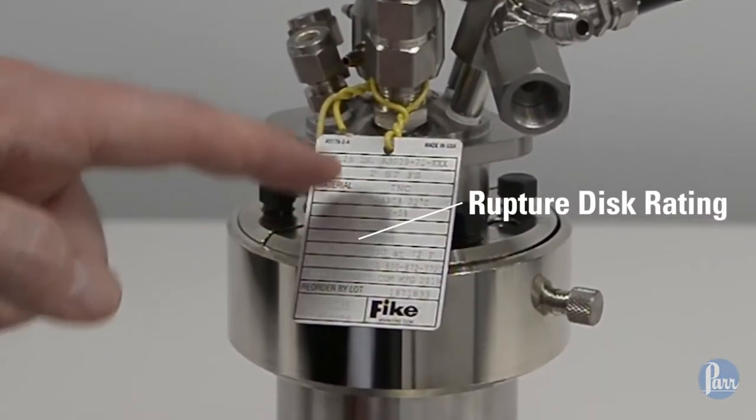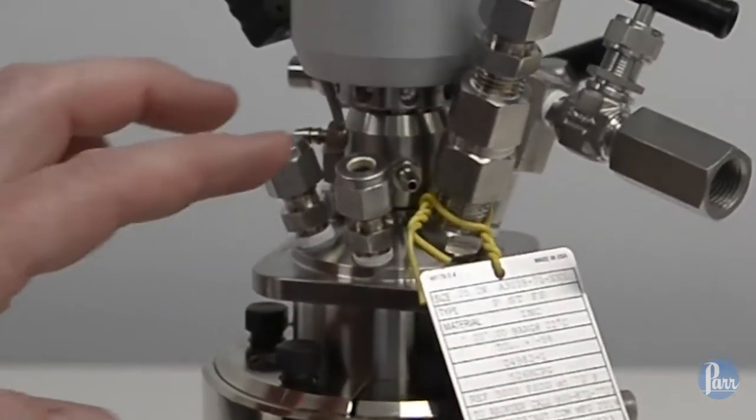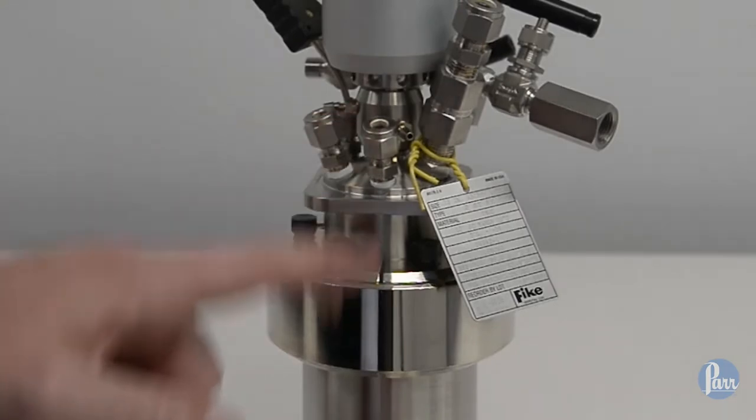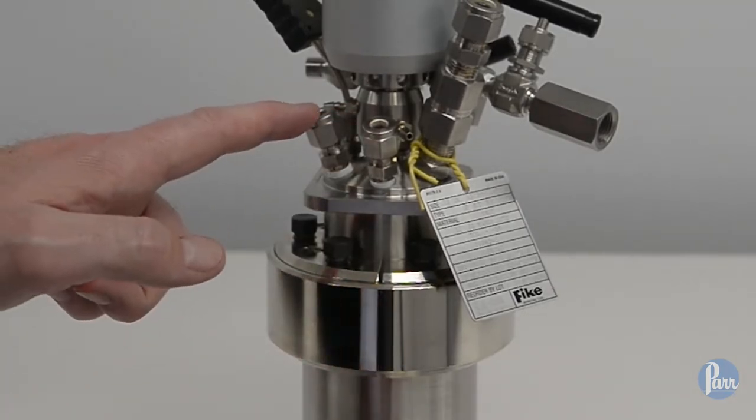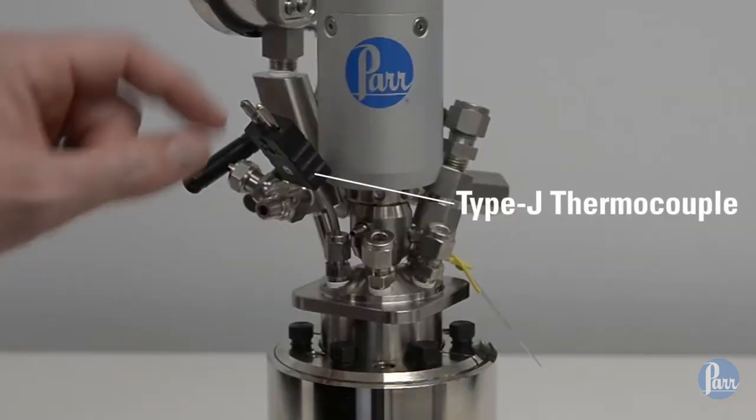The next two ports are for cooling water inlet and outlet, connected to the cooling loop inside the vessel. Finally, the thermocouple is shown here, a Type J in a vertical port.